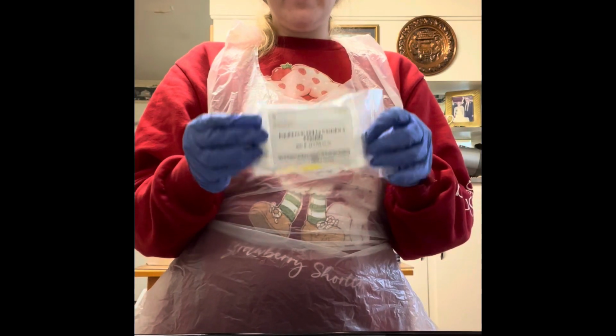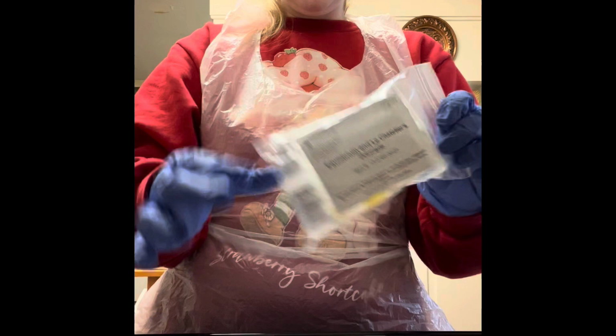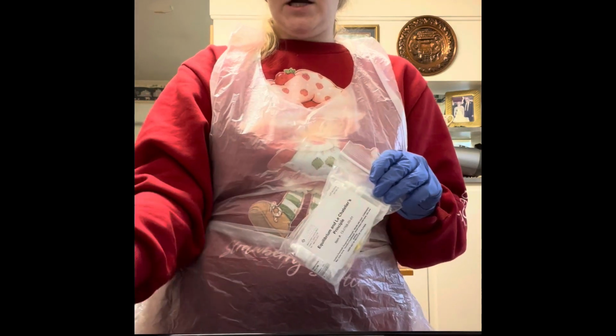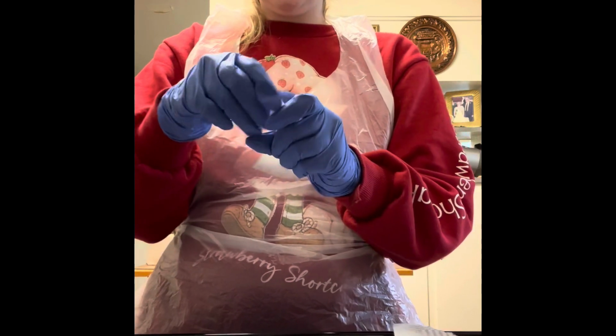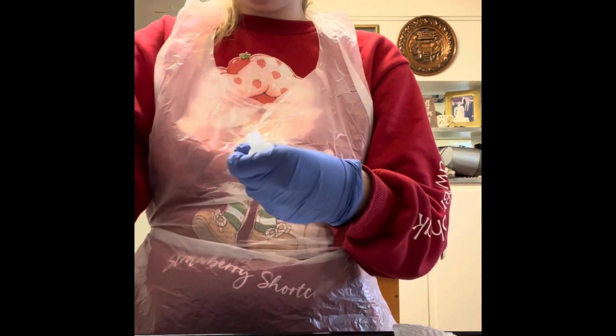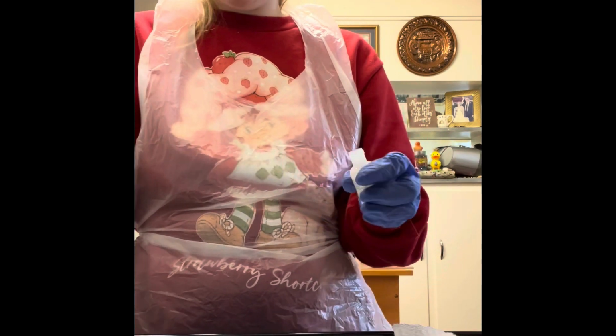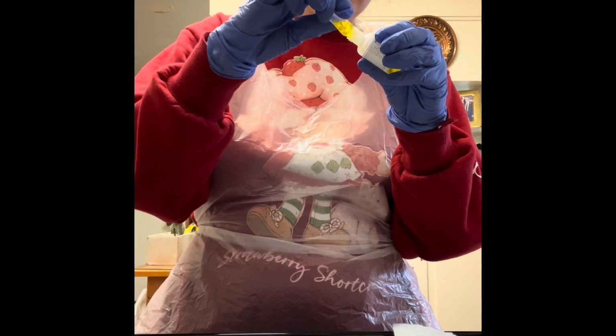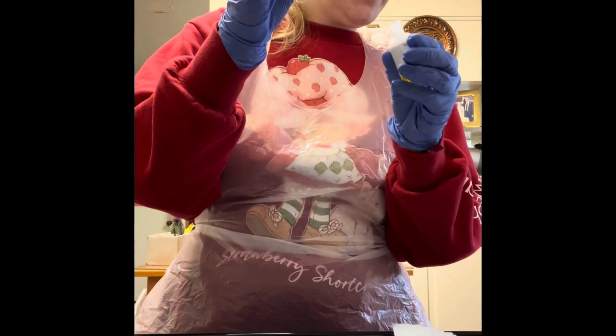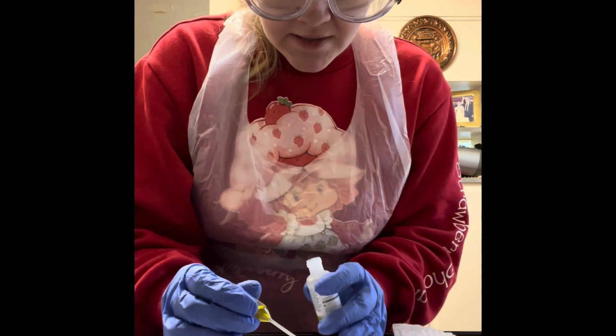and have fun. So first things first, I'm going to unpack my kit and get my well plate prepared. I'm going to do this off camera. So I'm going to start out with potassium chromate and I'm going to open it carefully. I'm going to get my pipette. I'm going to take it out and I'm going to do 8 drops.